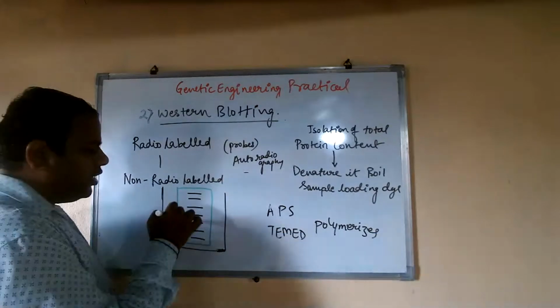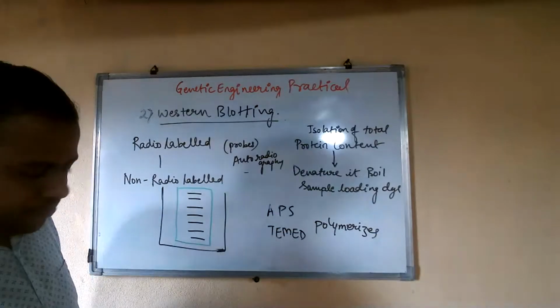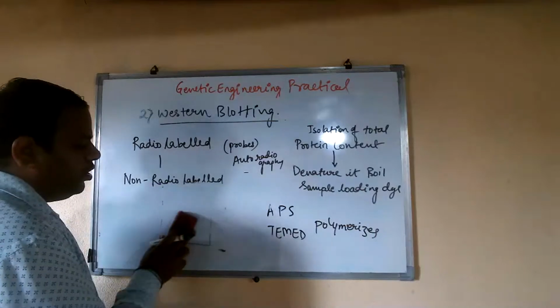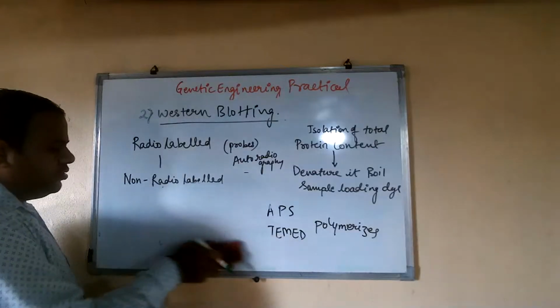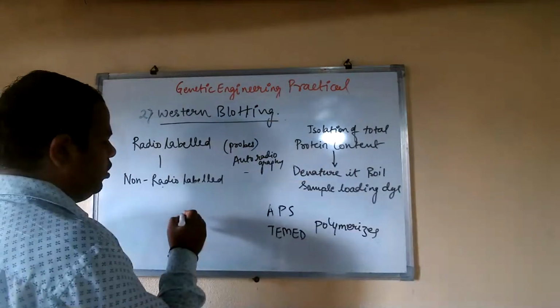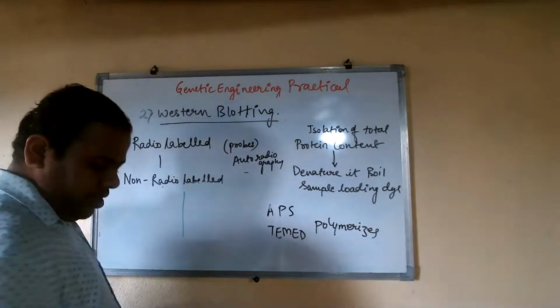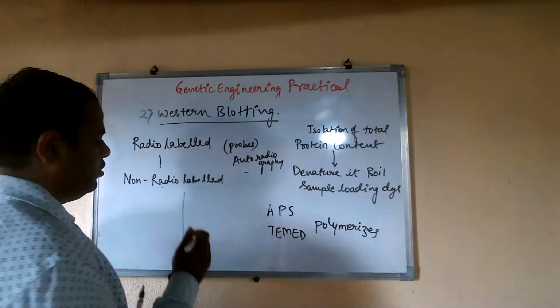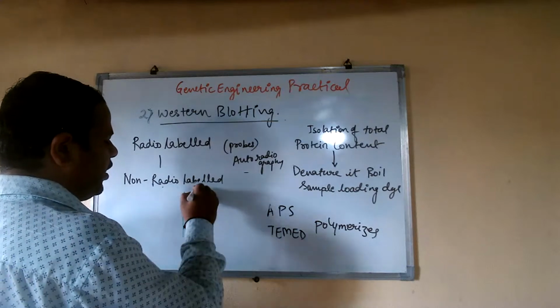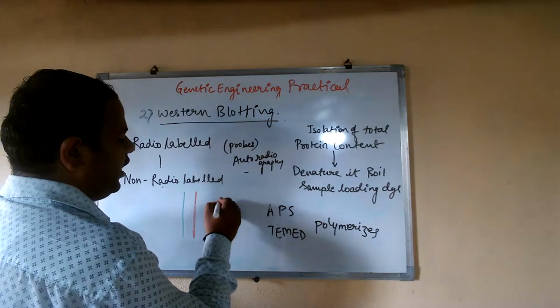So I am going to cut this particular well and prepare a sandwich of the nylon membrane. Suppose this is the nylon membrane and this is the gel. So in SDS page, the proteins have a negative charge.